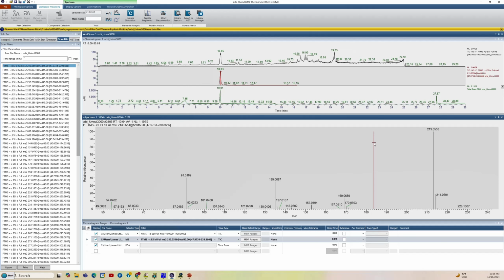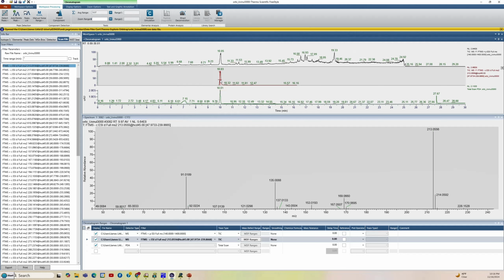Before you do that, I need to point out one other thing. Again, you cannot average the spectrum when you're trying to send things to the NIST search because it'll end up cropping off the significant figures here. So you just need to click on one spot in the spectrum to decide if it's a good spectrum or not. I'm just left clicking across it to check and see if it's the same all the way through. So I'll just pick it right here in the center.